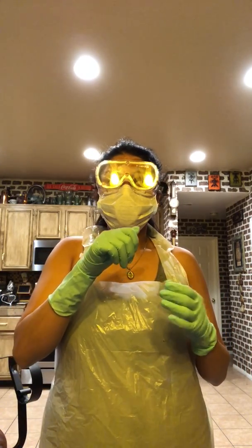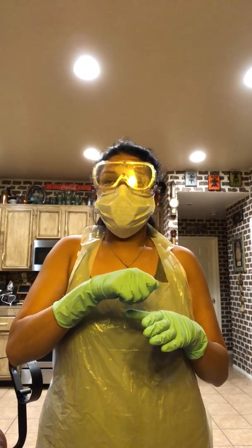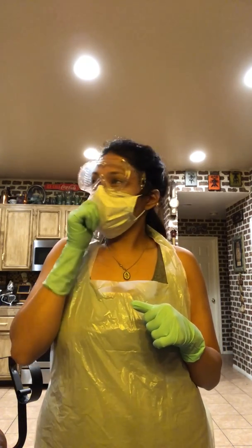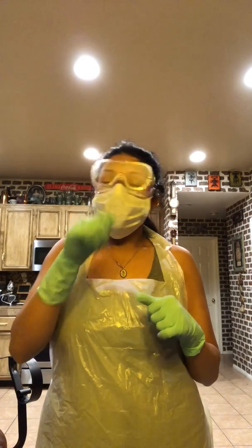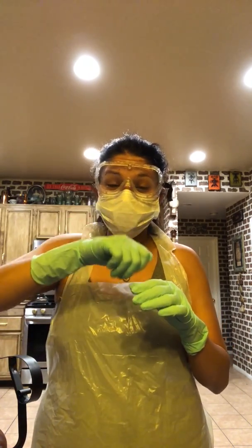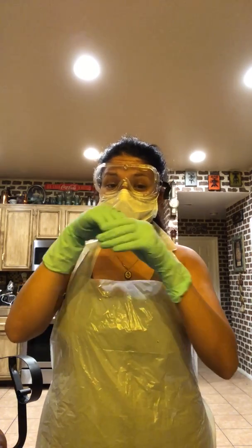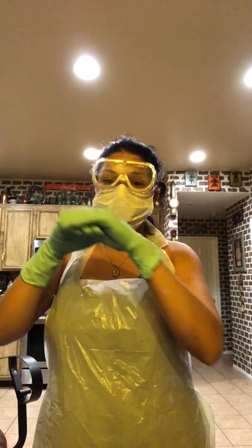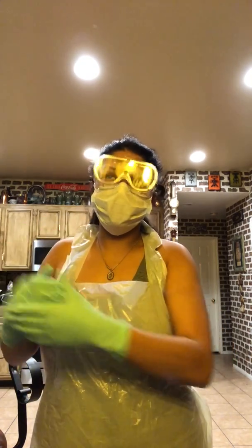From there, I got 0.25 milliliters. I grabbed it from tube 1, put it into tube 2, and mixed it up. From tube 2, I mixed it up and diluted it into tube 3, and so on and so forth.